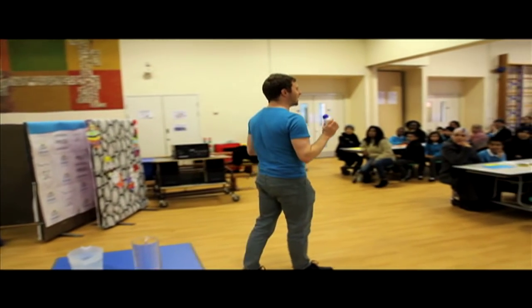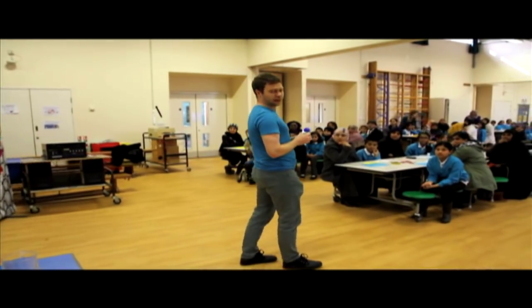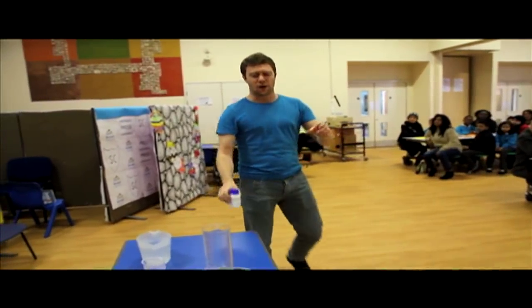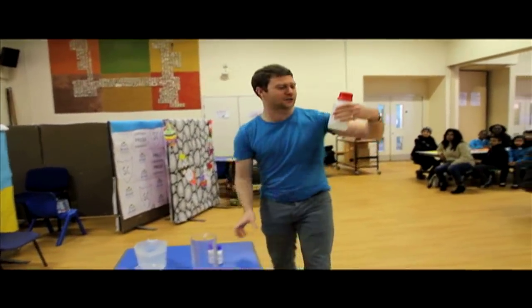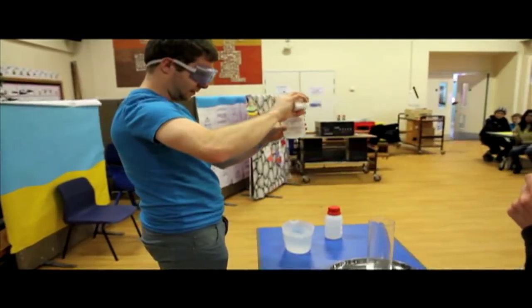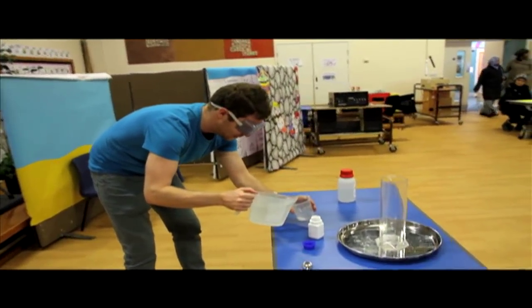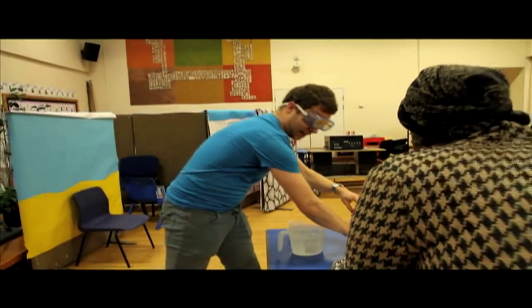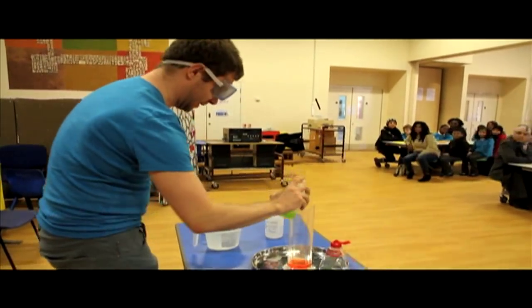This experiment is a chemical reaction between two substances. One of them is potassium iodide and one of them is hydrogen peroxide. Potassium iodide, 10 millilitres of water, food colouring, and hydrogen peroxide. I'm just going to add a little bit of fairy liquid because it gives us those nice bubbles.